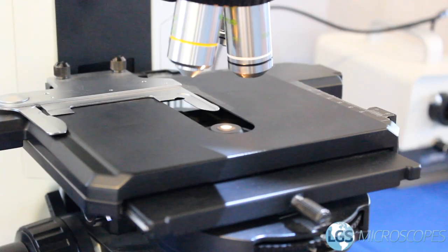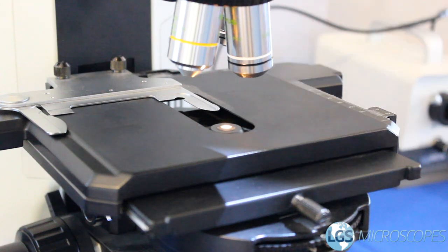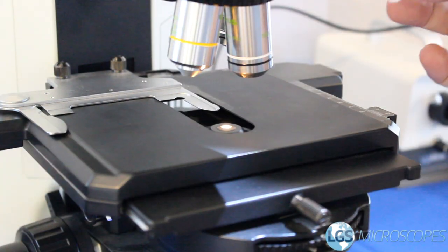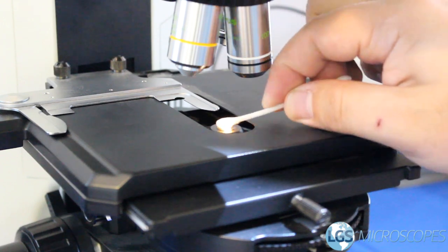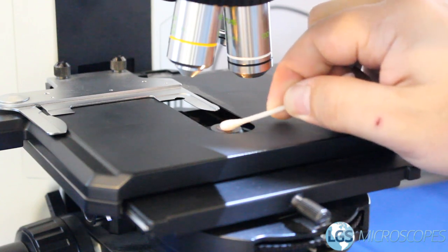Once you're done with the eyepieces you want to do the same process for this lens right here which is called the condenser lens. Take your q-tip, add just one drop of lens cleaner, and same thing — apply a little bit and rotate as you swirl it around. This lens is often easier to see if it's clean or not when you've got the light on.